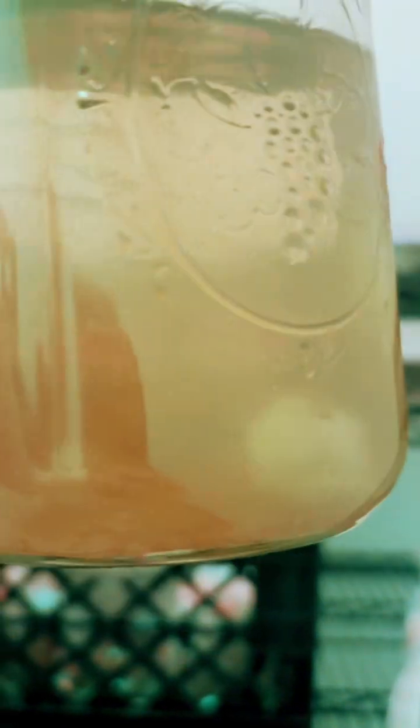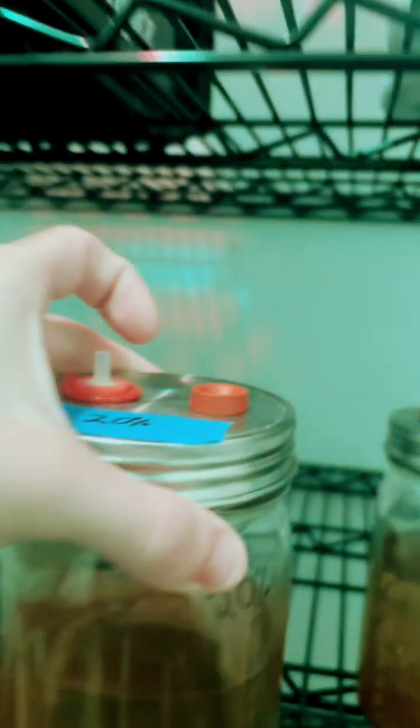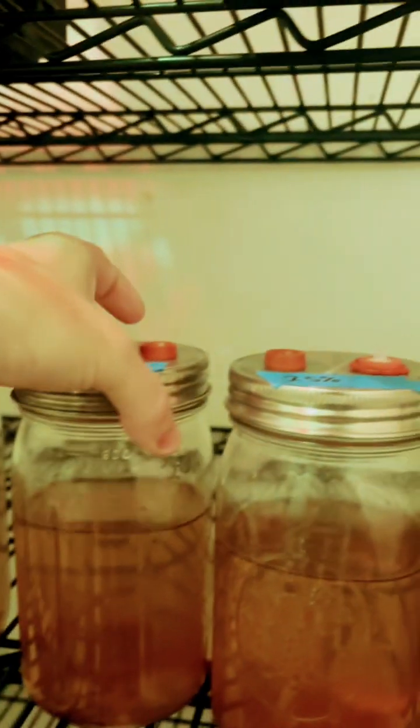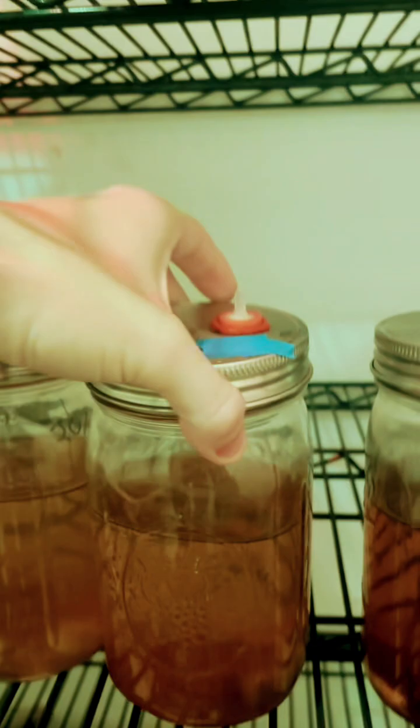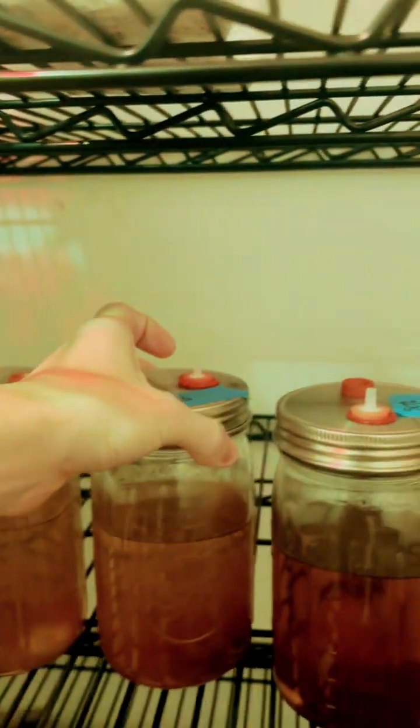And honestly from here there's just not as good results and it's more and more cloudy. So I'm wondering if maybe the sediment is skewing the test quite a bit. And this one just seemed like it got contaminated. I don't think anything grew in this 25% one.